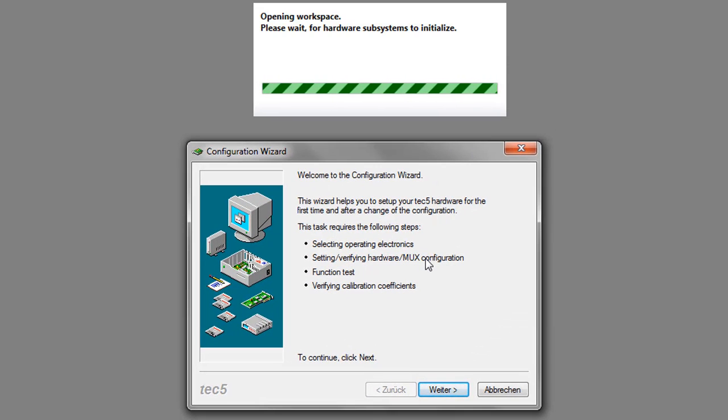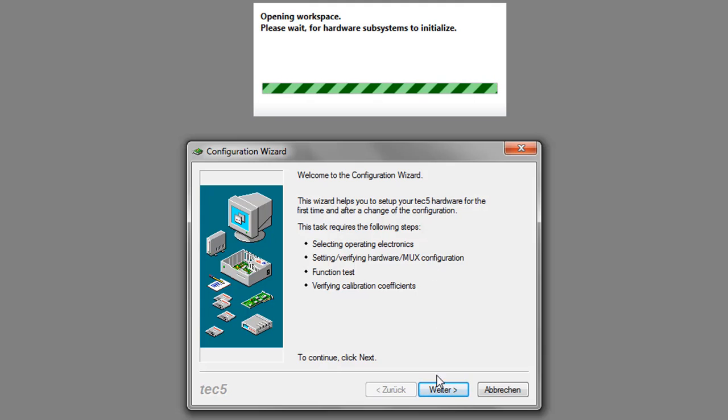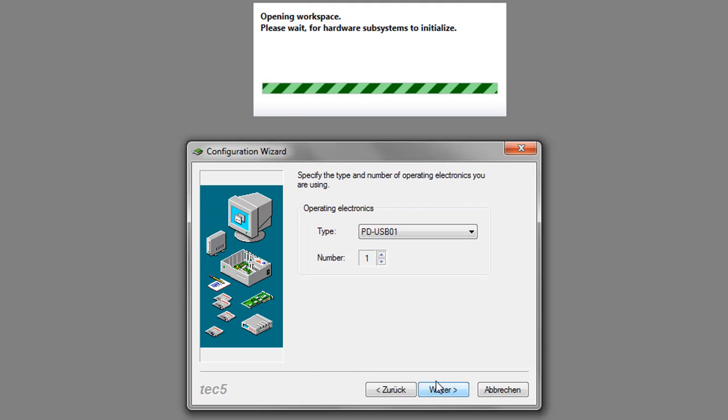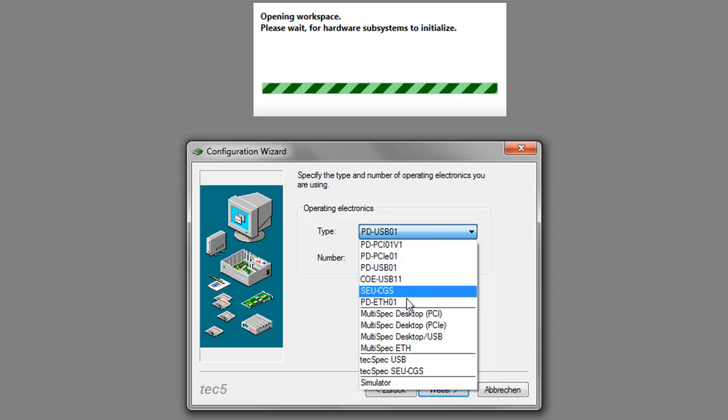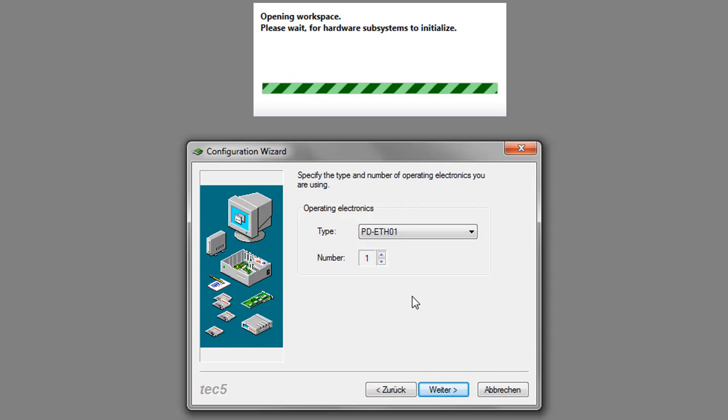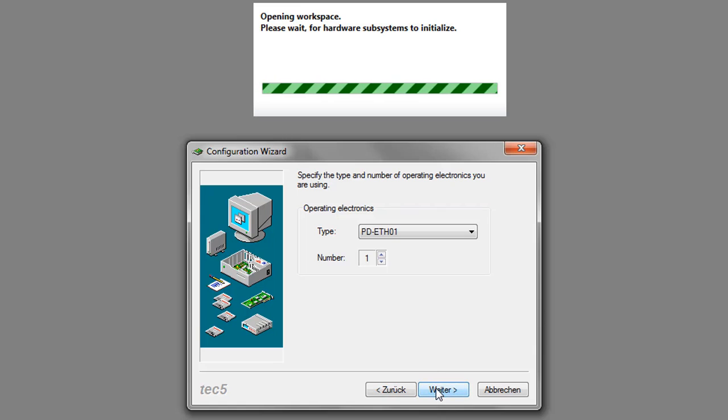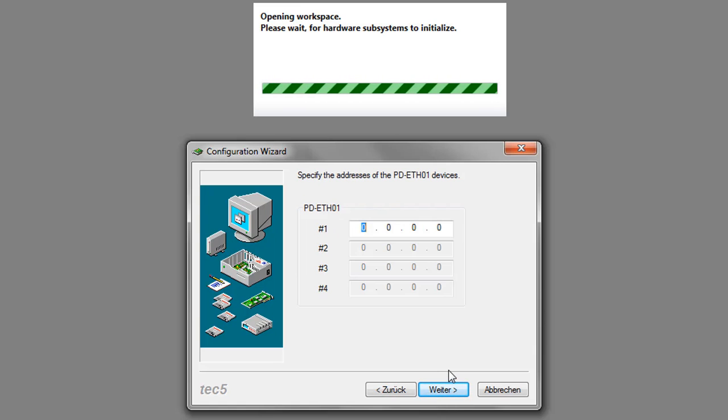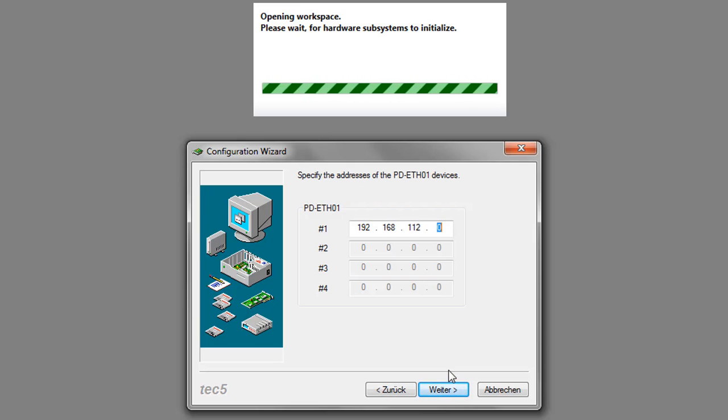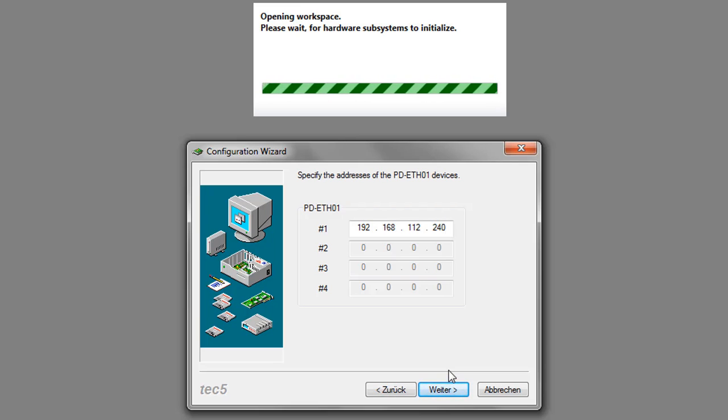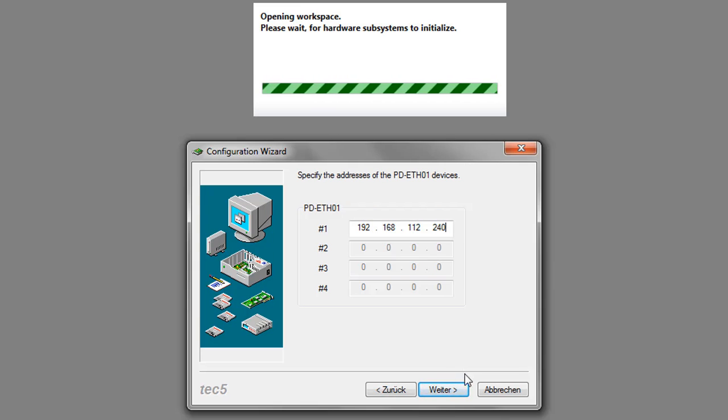The configuration wizard asks you for some information on your system. At first, you have to enter the interface electronics, which is an Ethernet electronic. You have to enter the IP address that can be found on a white sticker close to the interface electronics.